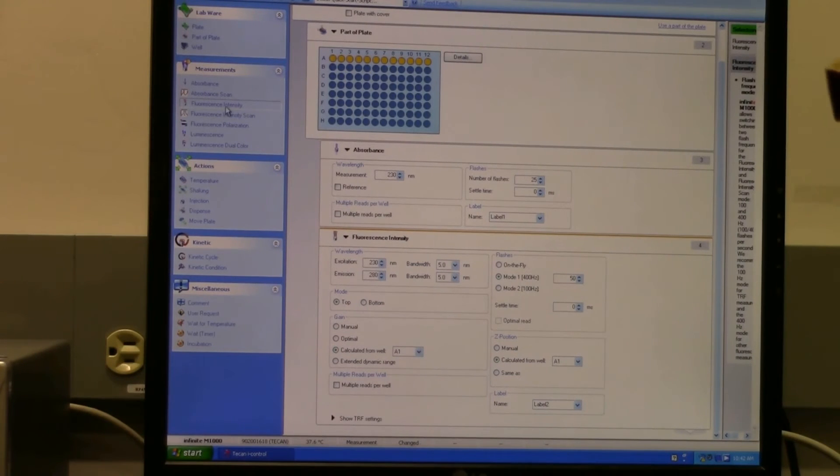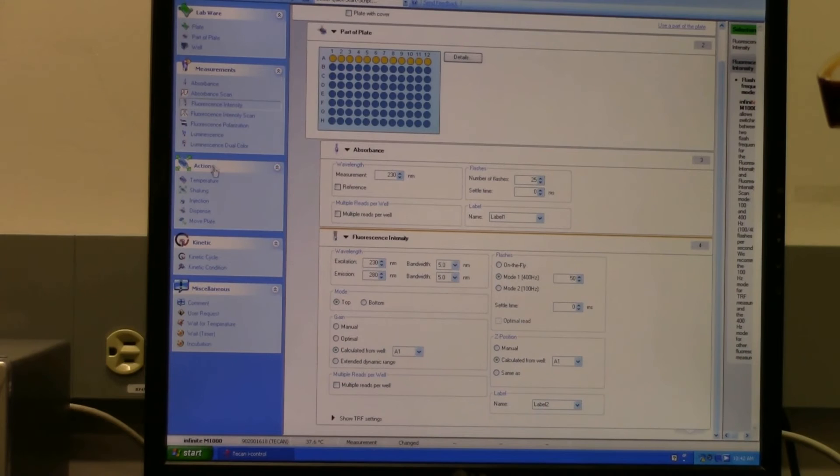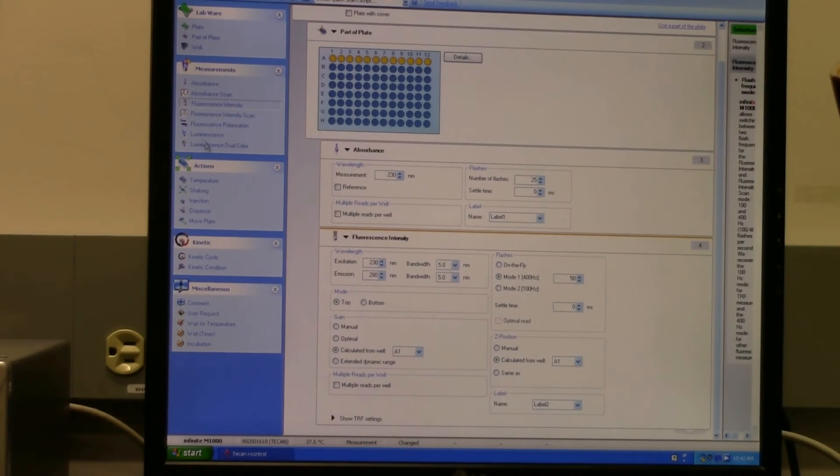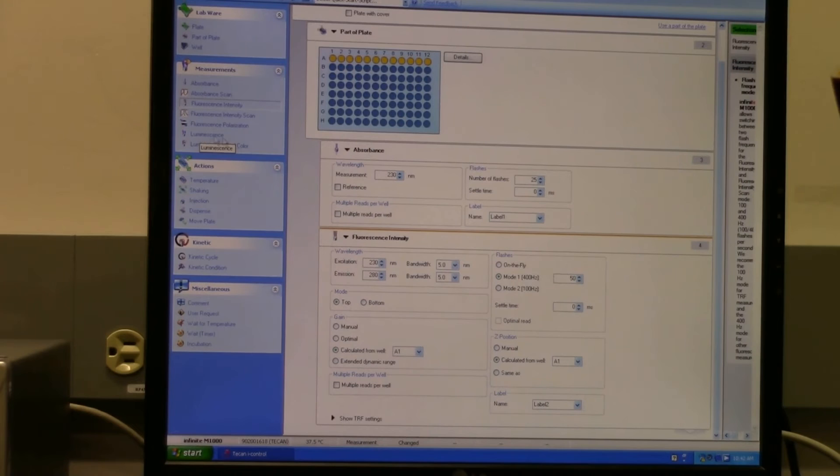So that's fluorescence intensity. It can do a bunch of other things too - they're all listed here. It also has luminescence capability.